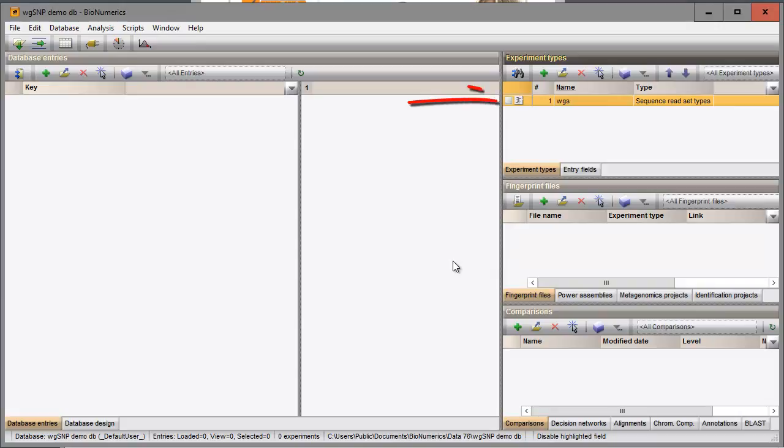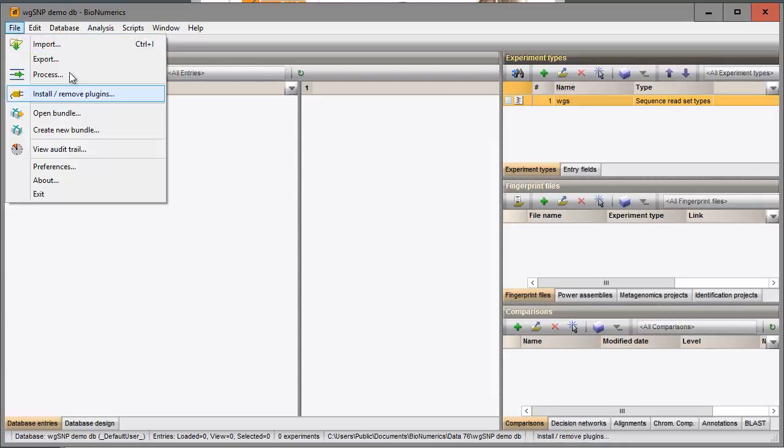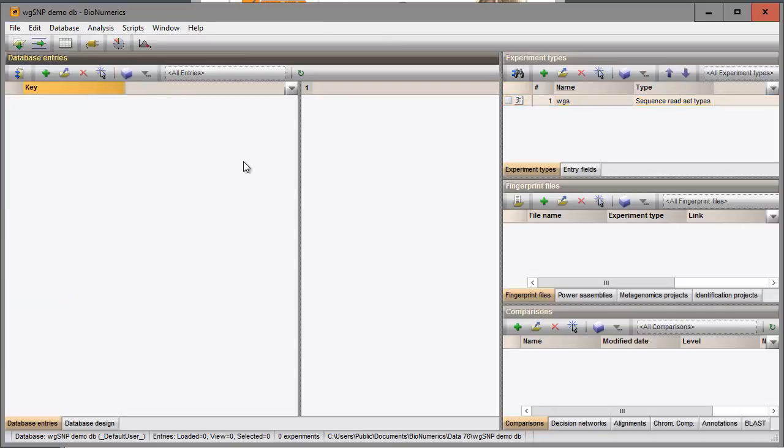The experiment is added to the Experiment types panel. To import sequence reads, select File Import or click on the Import button in the toolbar to call the import tree where all the import routines are grouped.